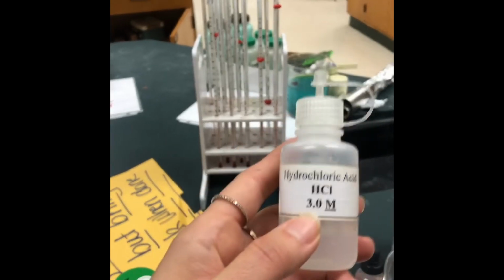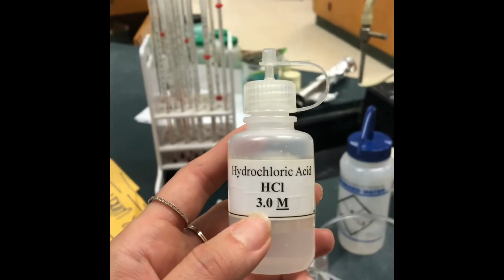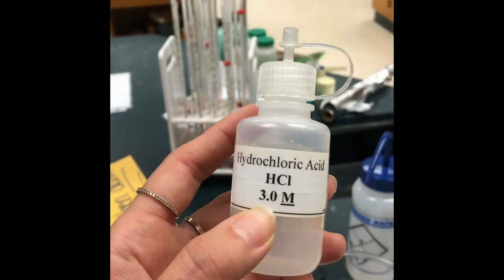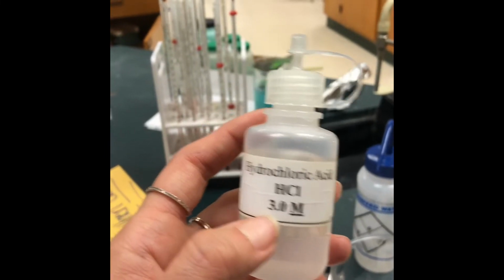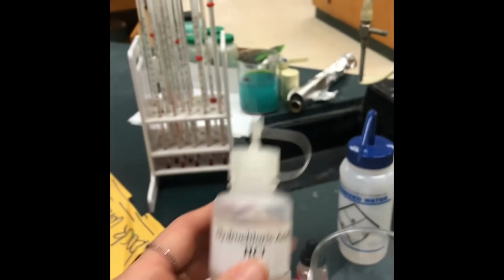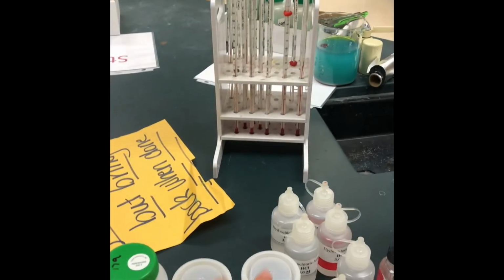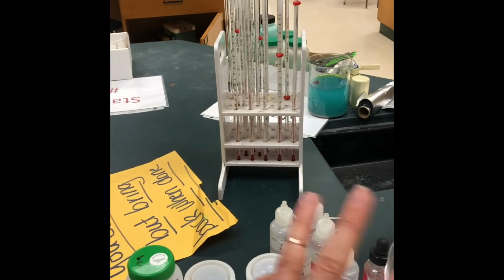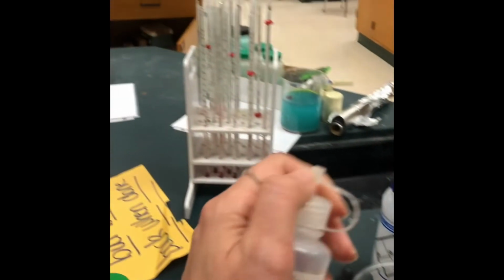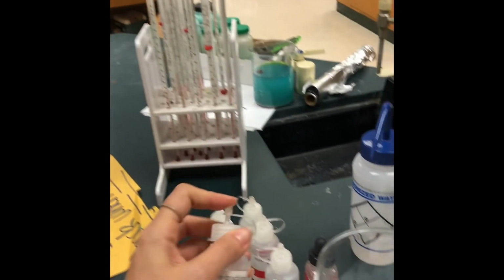You are definitely going to feel this if it drops on your hands. Remember, if you do spill any on your hands, good safety would be to wash your hands with soap and water, because soap is a base and it will neutralize it until the stinging stops. Okay, and you're also going to be using some of these magnesiums. Remember, metals react with oxygen in the air, so take what you need and recap all your bottles immediately, especially your liquids, because liquids like to evaporate too, so make sure that you recap everything.